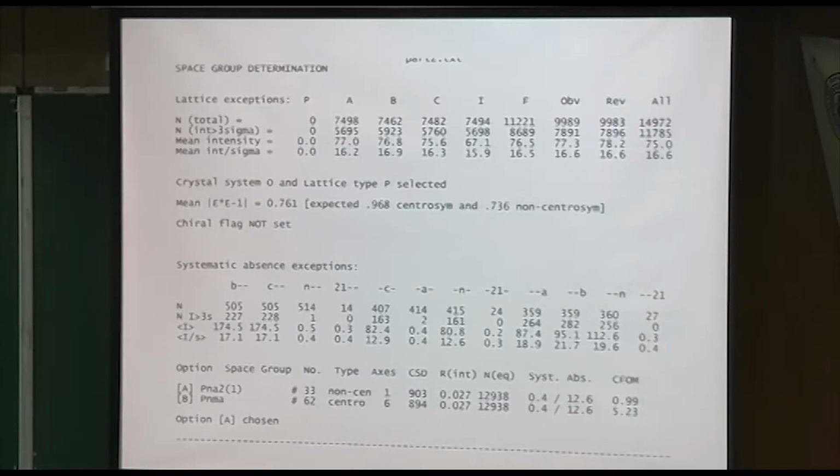slot. So this dash, A, dash, is talking about, like in the space group symbol, like here. Okay, and then the 2 sub 1 again is a subset of that, and then a 2 sub 1 along C. Okay, so taking all those things into account, and again, looking at the ones where there's either 0 or a very small number here, that means you're not throwing away anything important. 2 possibilities. One is centrosymmetric, that's B, and the other one is non-centrosymmetric, that's A. Both of those are in agreement with all of these absences or extinctions.